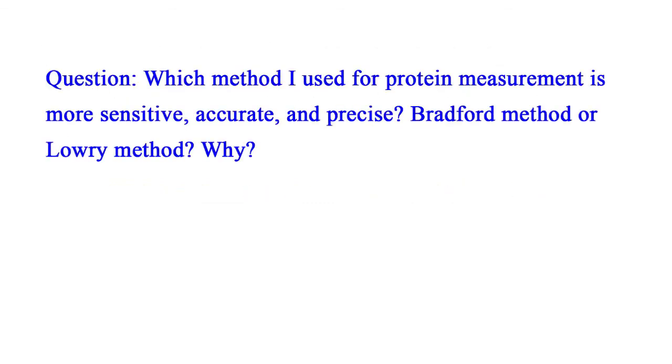Question: which method I used for protein measurement is more sensitive, accurate, and precise? Bradford method or Lowry method, and why?